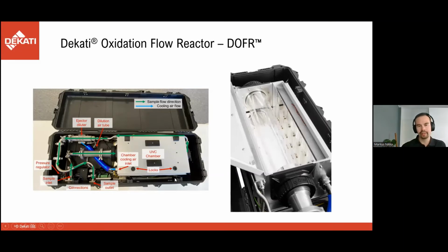Then we have the reactor chamber, the UVC chamber, and after the chamber we have the ejector diluter providing the flow and a good amount of sample for a large number of instruments.